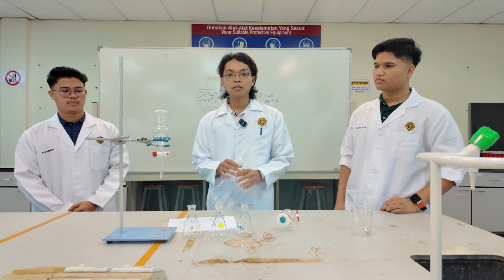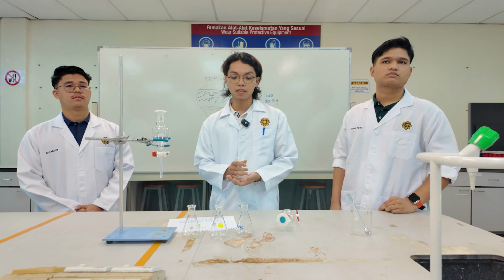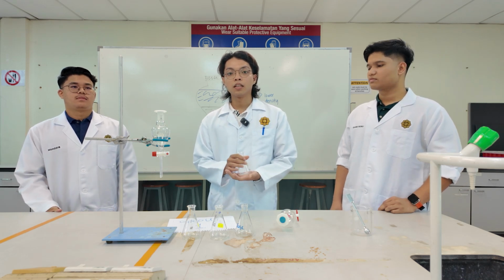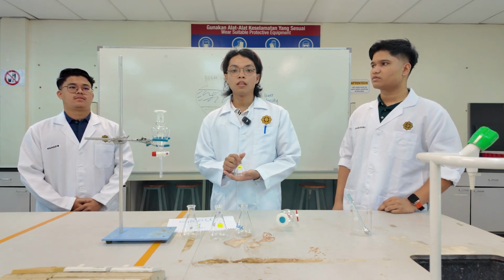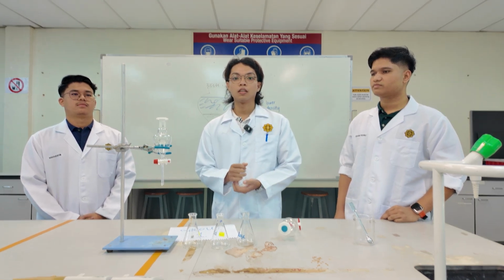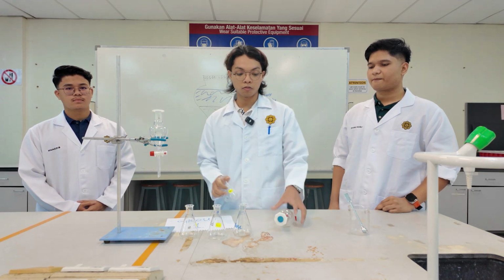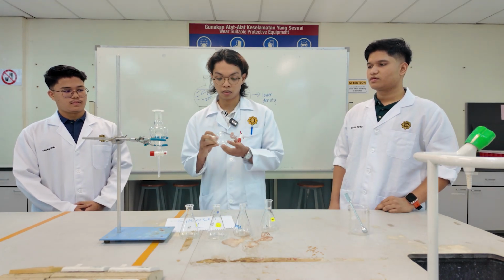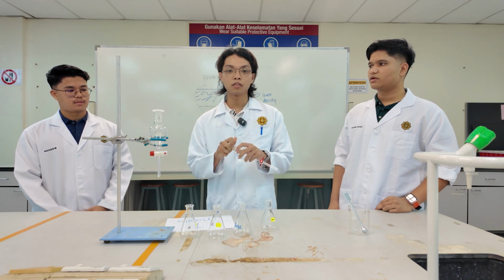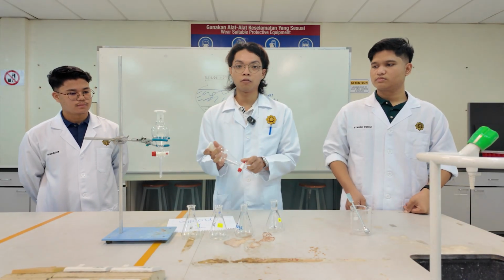We need to add a strong acid, because base basically reacts with acid. So we add 10 ml of 5% hydrochloric acid, and make sure you use your gloves, because hydrochloric acid is very corrosive. Then when you add it, you need to transfer it to this funnel. After that, you need to shake vigorously.